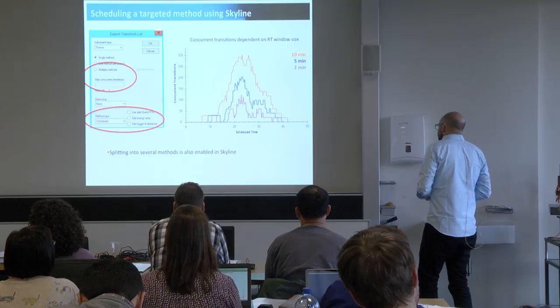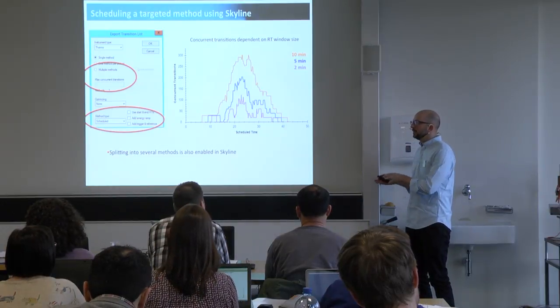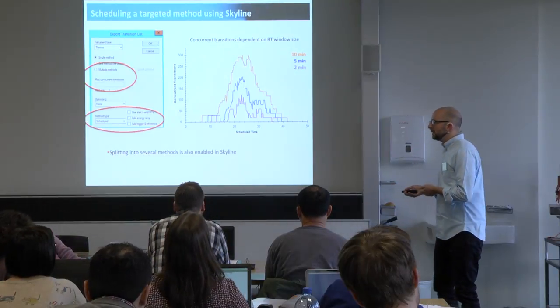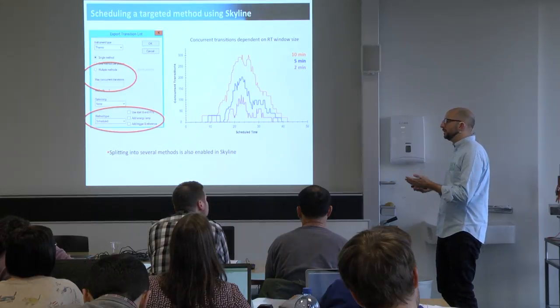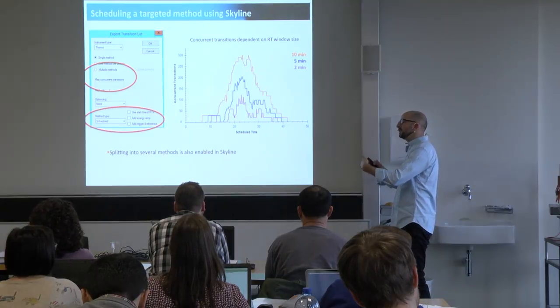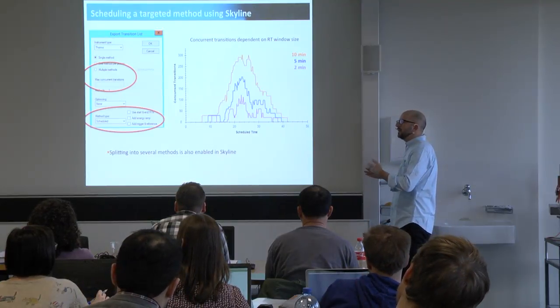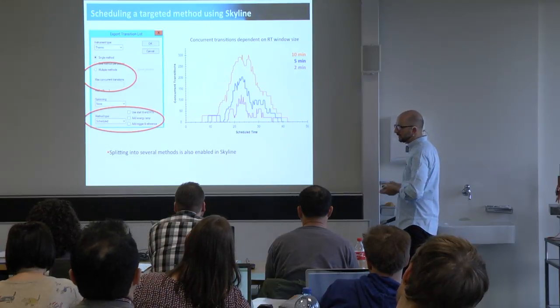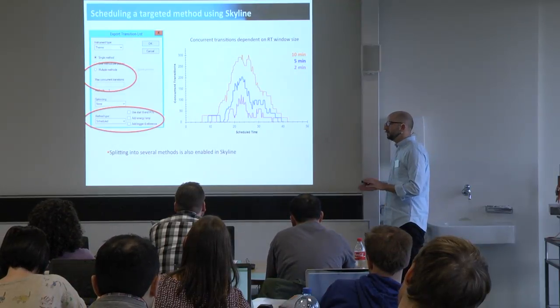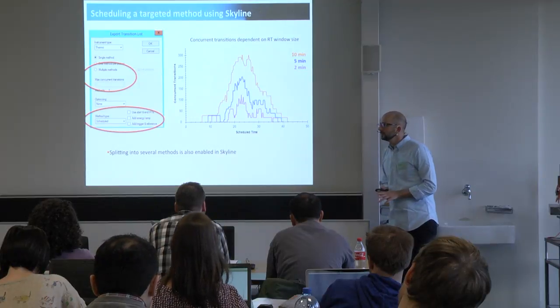So is accumulation time and or injection time the same thing as acquisition time? So partially yes. So the injection time is on a different type of instruments that relates to the Orbitrap. It relates to the same thing as acquisition time, but as you know, when you set your injection time, you also need to think of your AGC, of your automatic gain control. So these two things already interplay, but relatively I would say, yes, this is kind of looking at the same thing, but with the premise of the different instruments and how they actually function. So, okay.